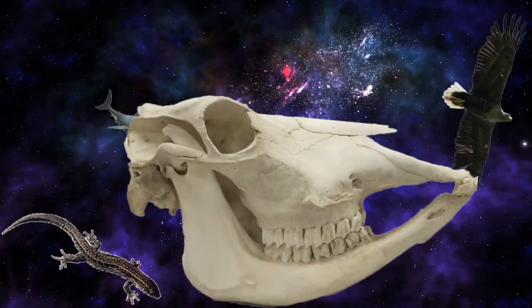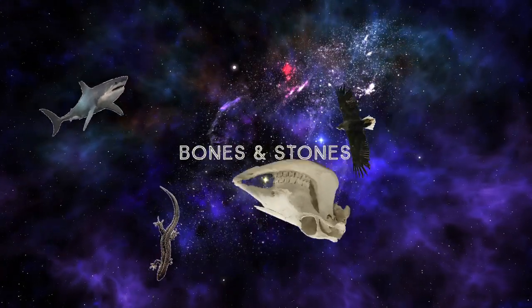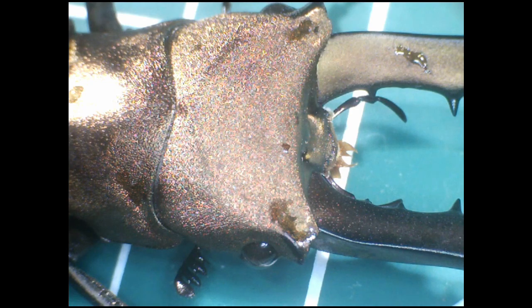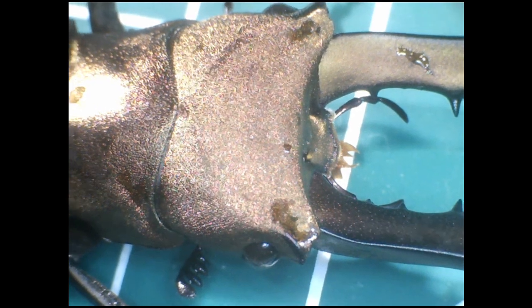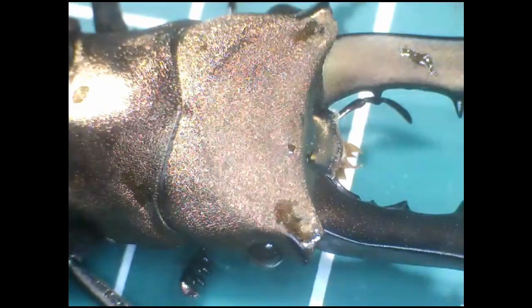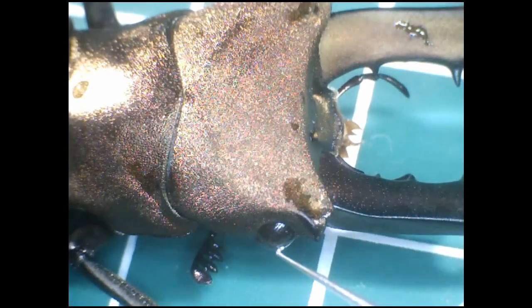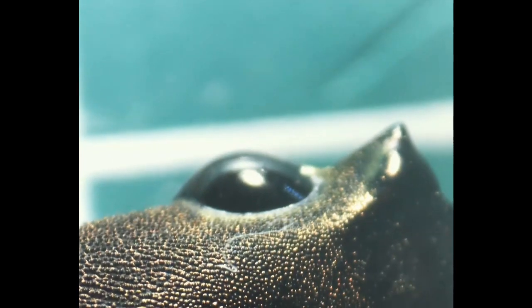Right, preamble over, let's get started. Before we reach for our instruments, we must of course inspect the surface anatomy. This is the head, and the most important part of any head are the eyes. If I zoom in further, you can see that, like all insects, this beetle has compound eyes.